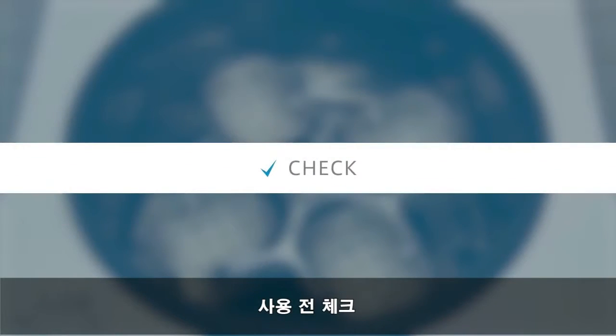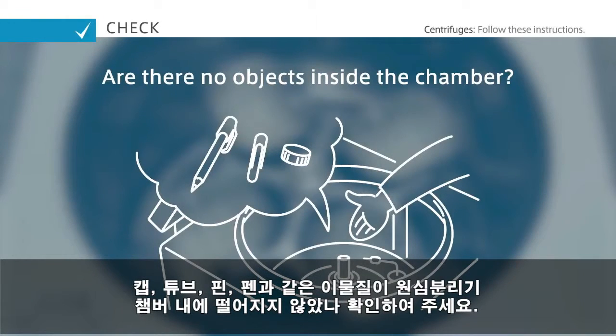Before starting your centrifuge, make sure to do the following pre-use checks. Make sure that no loose objects such as caps, tubes, clips, or pens are falling inside the chamber.